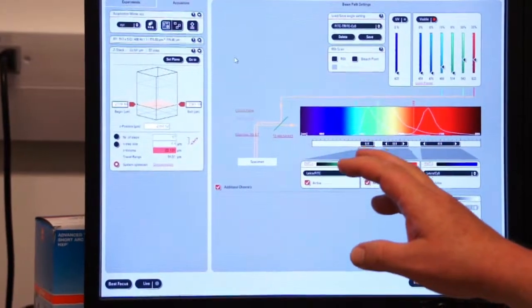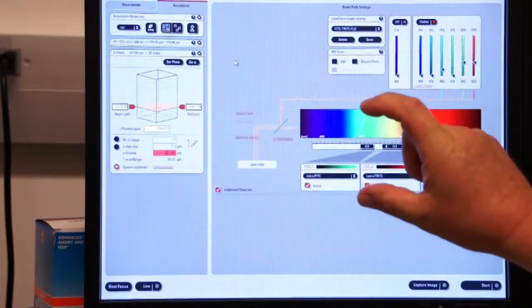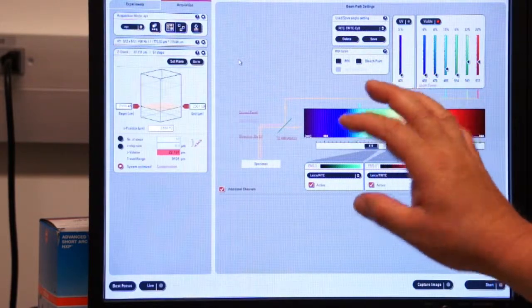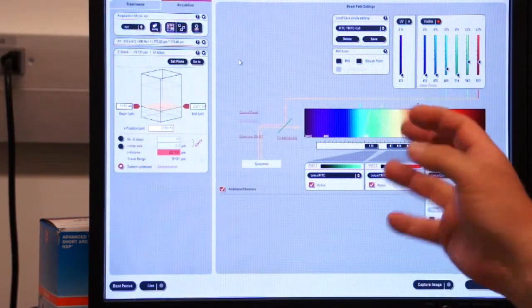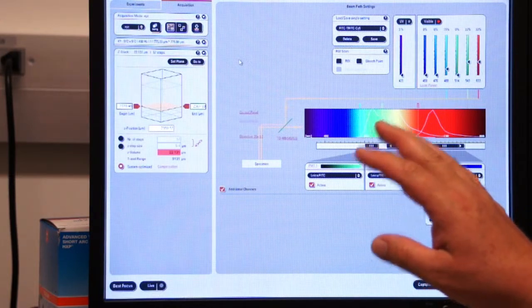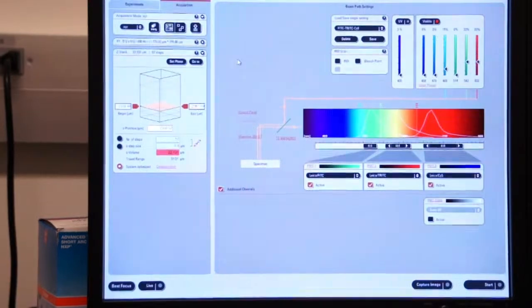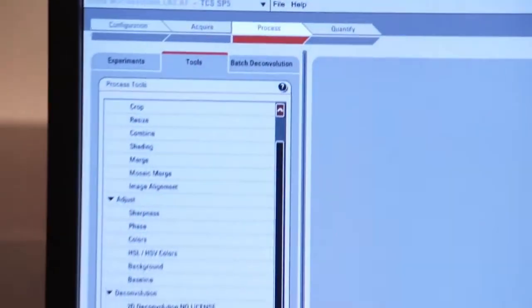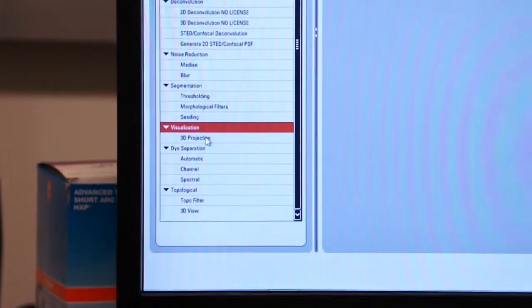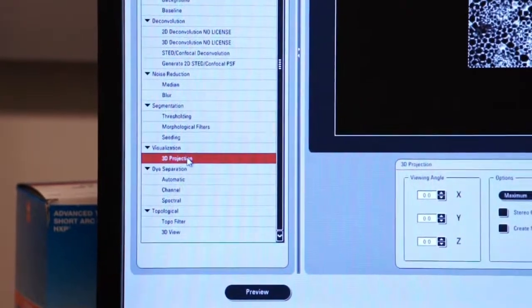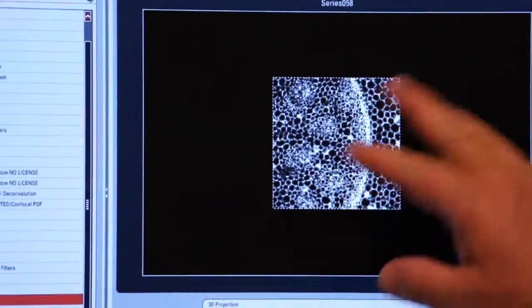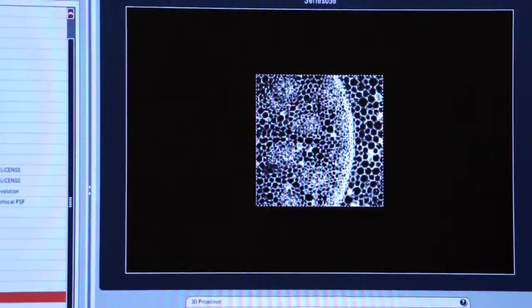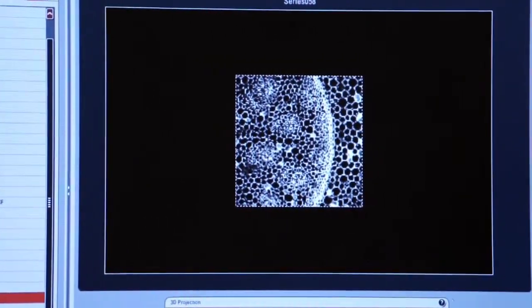Now that we've taken our Z-Stack, we have all of those images in our volume of tissue. We can make a 3D model, and we can rotate this so that you can quickly see relationships between organelles and different organs and tissue that you're looking at. In order to do that, we have to click on the Process tab. So we'll click on Process. We're going to click on 3D Projection. So let's select 3D Projection. And now it's going to return our Z-Stack in a black-and-white confirmation that we could look at in the stereo series here.